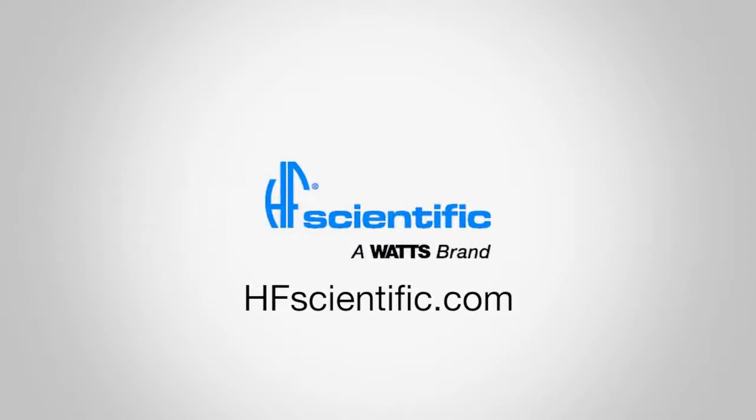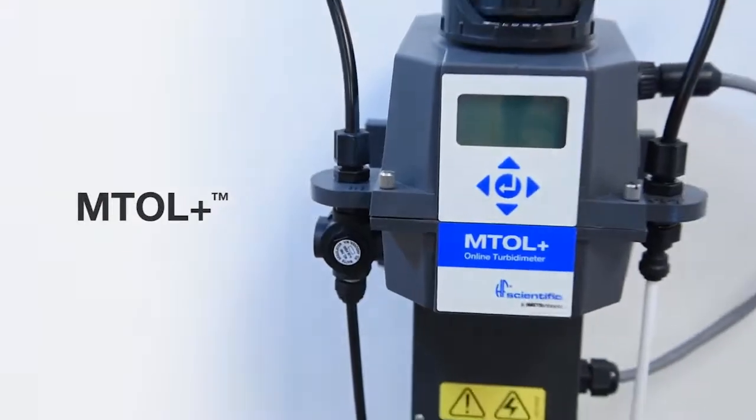For more information about the MTOL Plus and other HF Scientific instrumentation, visit our website or contact your HF Scientific representative. When your application requires online turbidity measurement, all you need is the MTOL Plus.